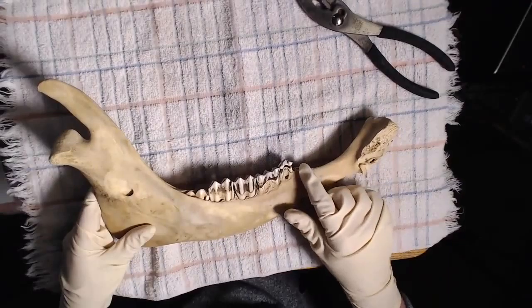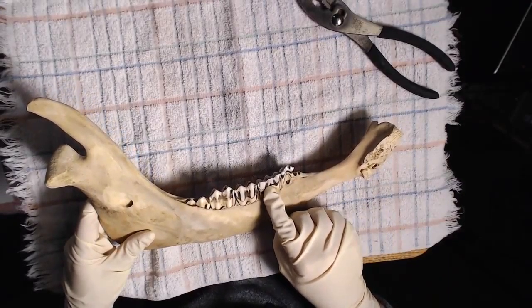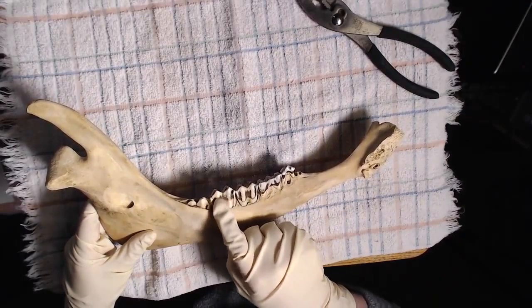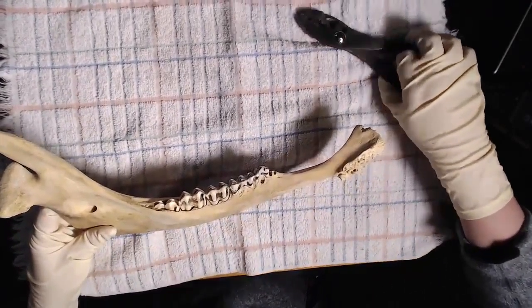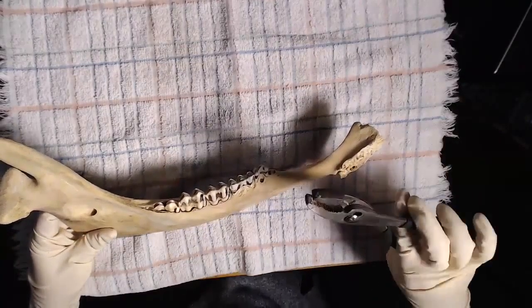the cow jaw. So the first 3 teeth that you see should be the premolars, and then it should have 3 more towards the back of the mandible, which are the molars. And now you should have pliers at your site, so go ahead and take your pliers and try to remove one of the teeth.